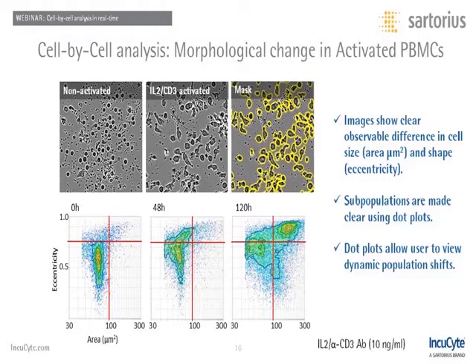Now, aside from differences in morphology, PBMCs themselves are made up of a host of various different immune cells, and using phase alone, they cannot be distinguished from each other. For further subset identification, fluorescence must be used.